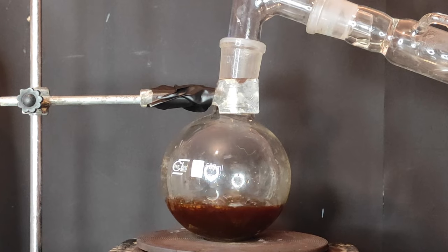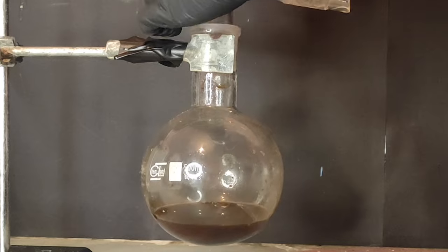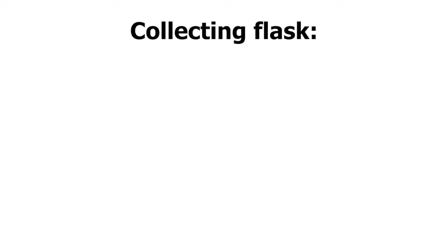So I've left it to distill for around 3 hours, and I went to play some Fortnite. After I came back at this one to the apparatus, what we're left with in the collecting flask is a solution of nicotine, water, and some essential oils.